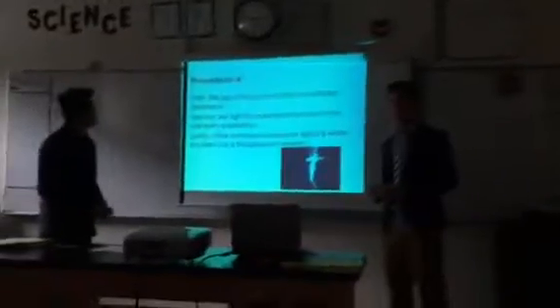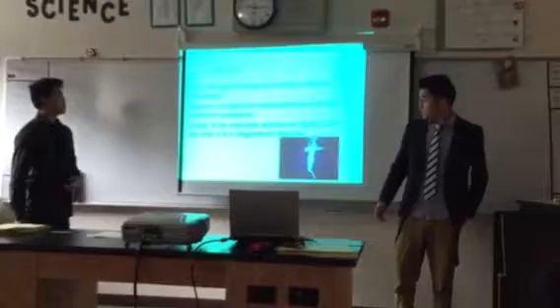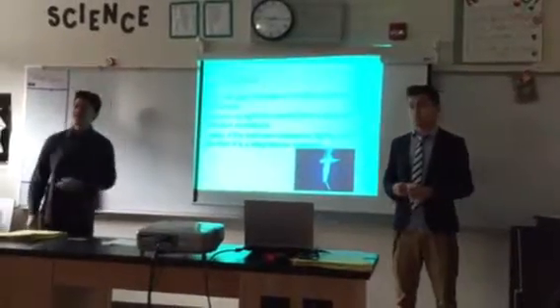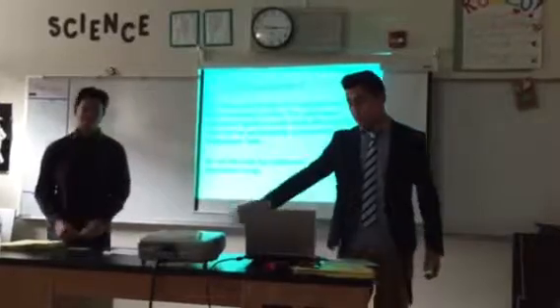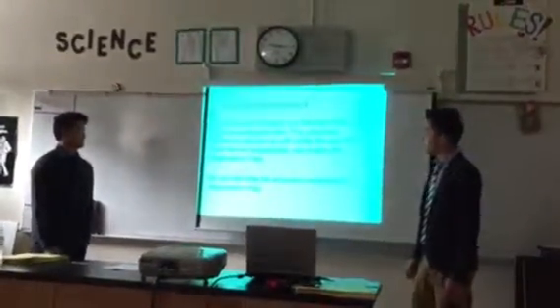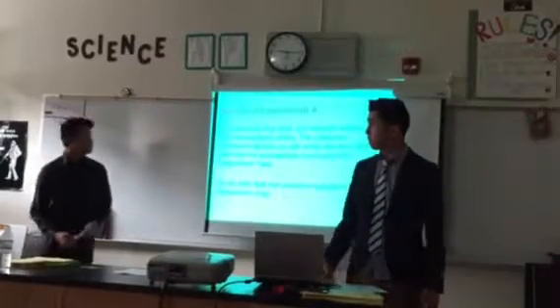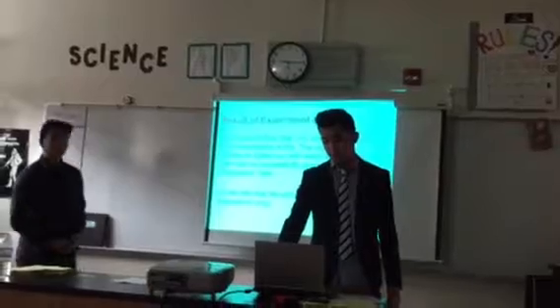First, we took forceps to hold the unknown substance. Second, we lit the matchsticks to burn the unknown substance. Lastly, if the unknown substance lights a white fire, then it is the element magnesium because it's a chemical reaction. Moving on, the result of the fourth experiment. We observed that after 2 to 3 minutes within the high temperature of fire, the unknown substance lit up with the white fire, and we inferred that we successfully conducted the magnesium test.